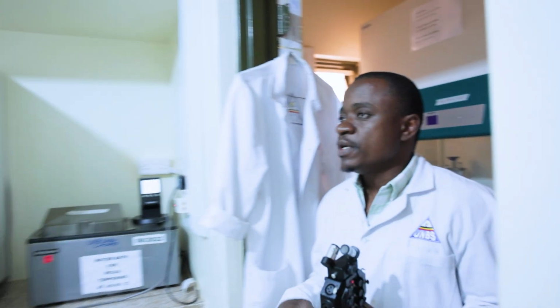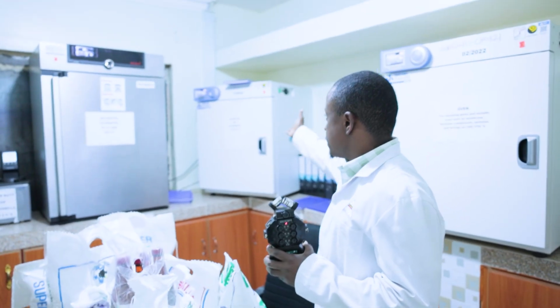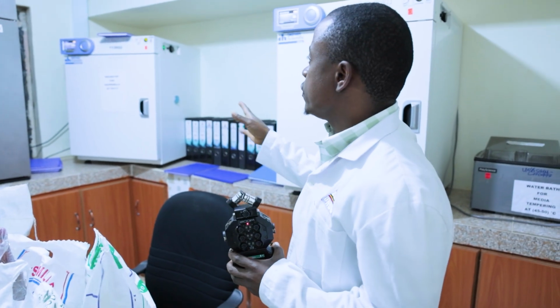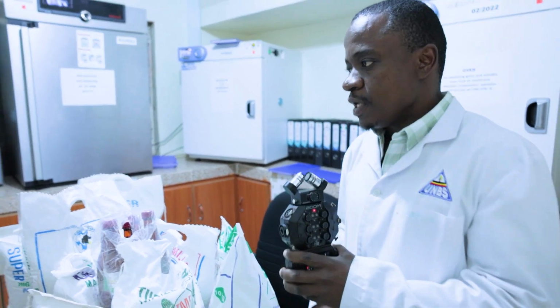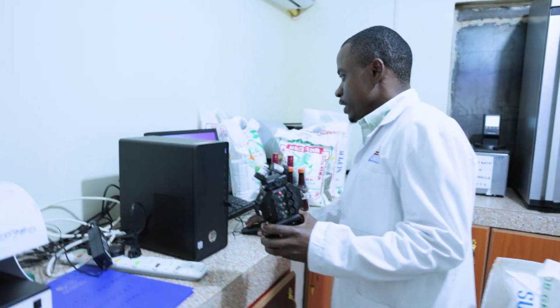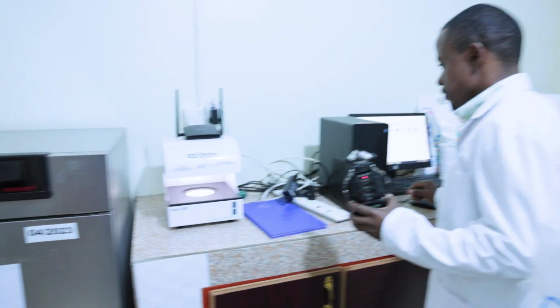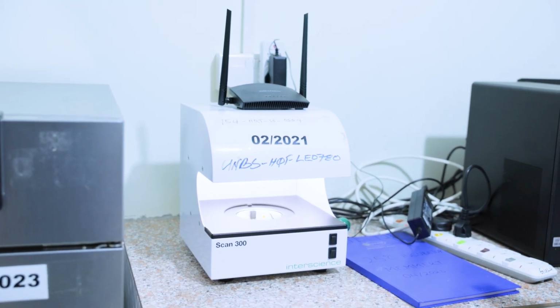Now, incubators, we have many because we incubate at different temperatures. So we have this, and those two that you saw in the corridor there, those big ones. We incubate at different temperatures for a particular time. Then after incubation, we have this one here. It is called an automatic colony counter. It is where we read our results from.